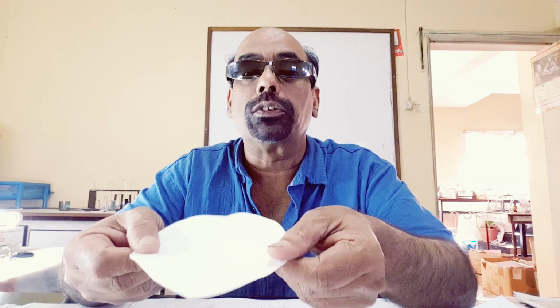This is after filtration. We have barium sulfate collected as residue on the filter paper. This is the white solid, barium sulfate. Barium sulfate solid can be washed with water several times to get it in a pure state without contamination, and then it can be dried or allowed to dry.